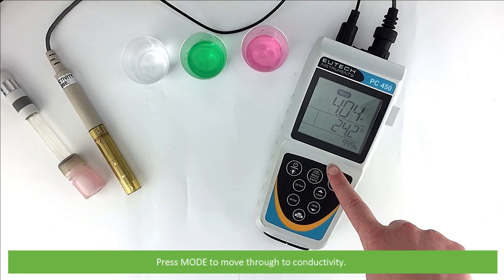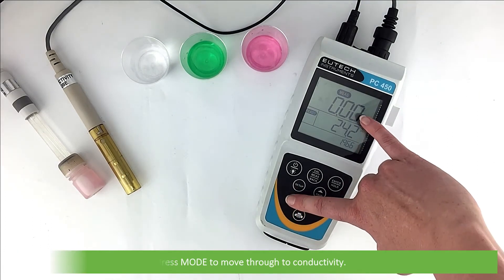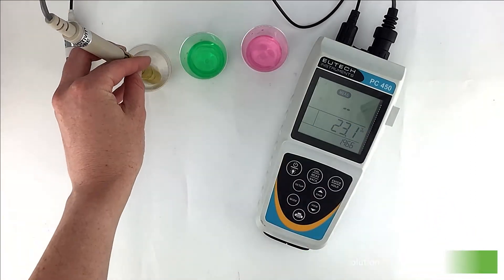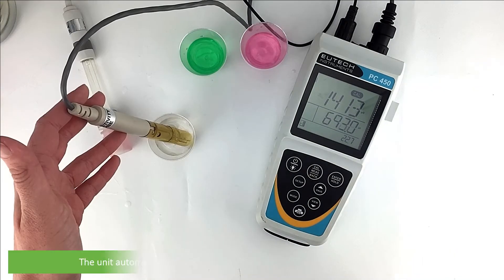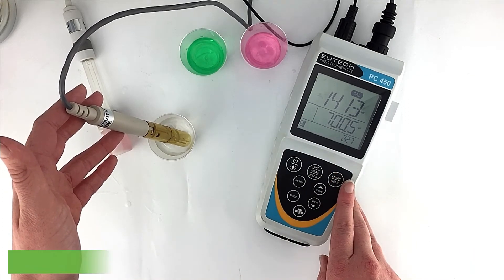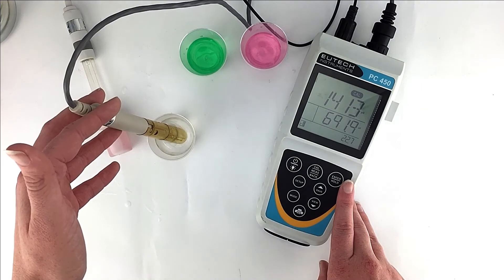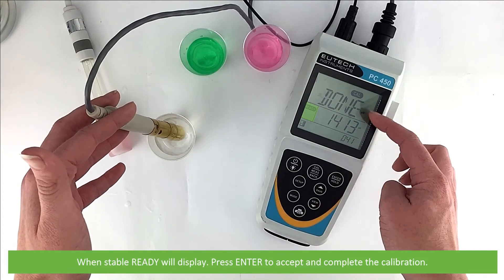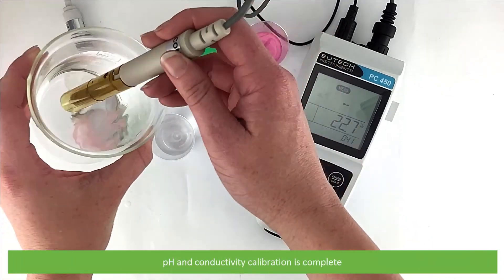Press Mode to move through to conductivity. Submerge the conductivity probe into the calibration solution. Press Cal. The unit automatically recognises the buffer and displays it on the top of the screen. Wait for the reading to stabilise. When stable, Ready will display. Press Enter to accept and complete the calibration. The unit will then automatically return to measurement mode. pH and conductivity calibration is complete.